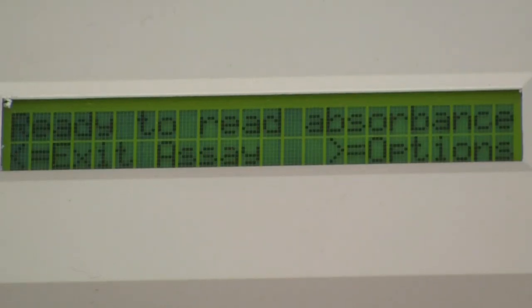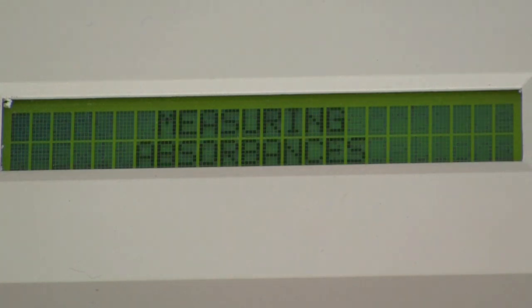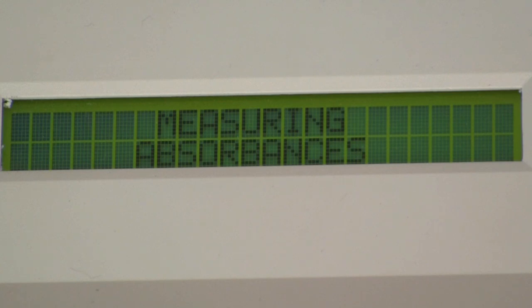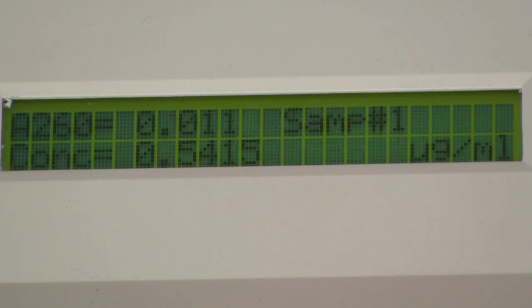When finished, the display will show that the absorbance is 0.011 and the concentration is 0.5415 micrograms per milliliter.